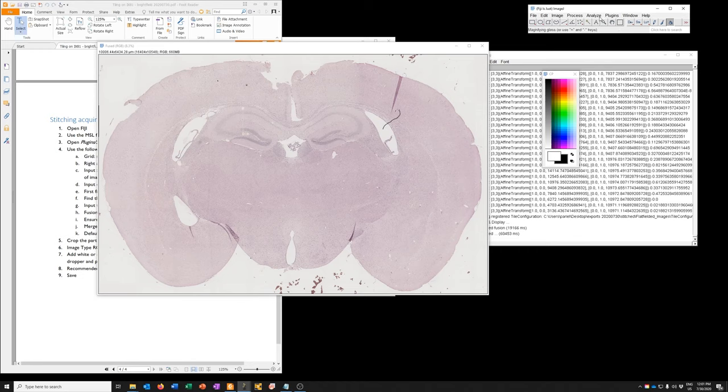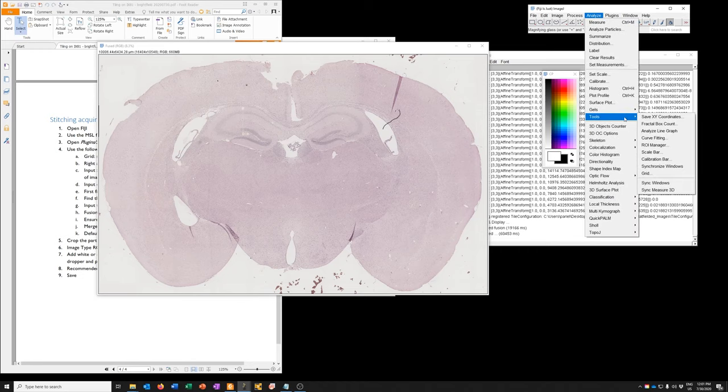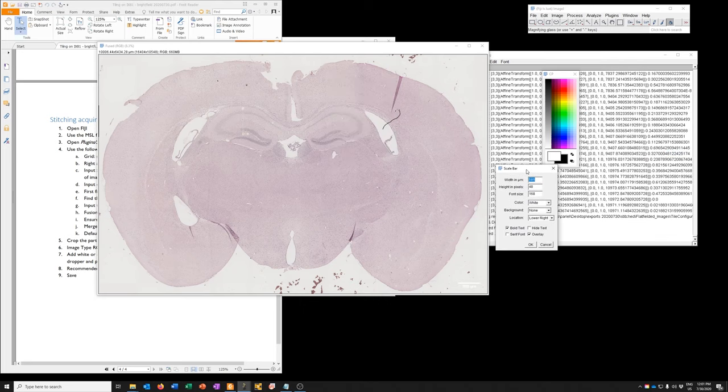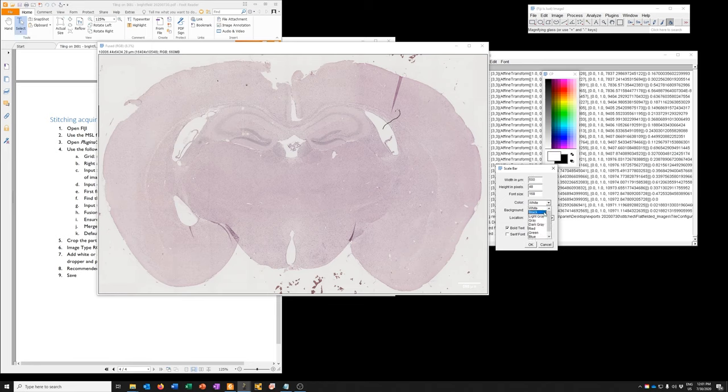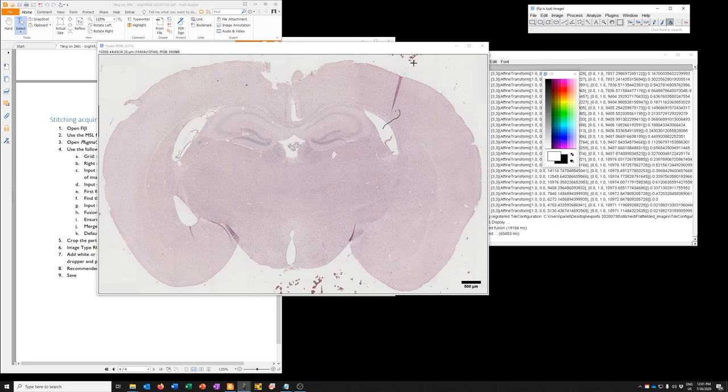Now that it knows the scaling of this image, we can go to analyze tools, scale bar, and add a scale bar of whatever size we want. For example, we could add a 500 micron scale bar. We could make the color black. We could make it thicker if we wanted. We could remove the text, et cetera, et cetera. And we're just going to say okay. And now we can save this image.